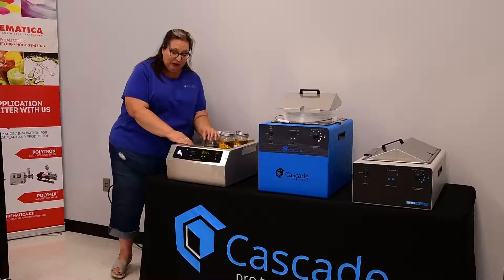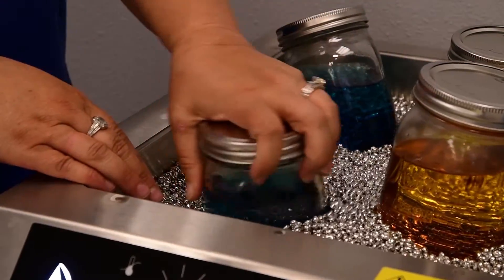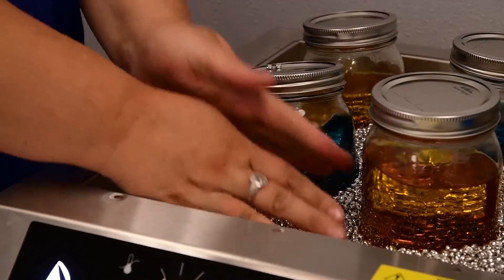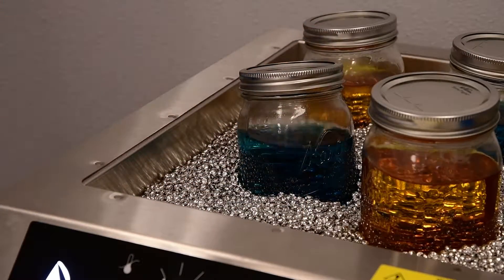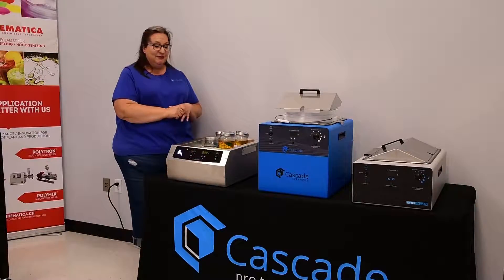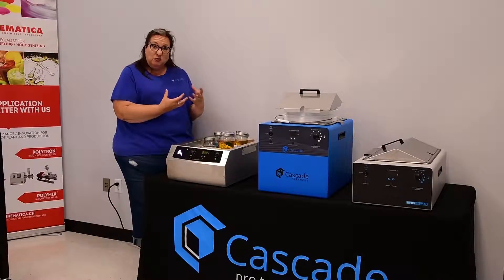We have worked with microbiologists to develop the lab armor bath beads. Instead of putting water in a water bath, we put in these highly polished aluminum beads, and we've done a ton of testing on this. We'll do over 30 temperature probes in the bath in all different locations, and what we found is that it has the same if not better thermal performance as water. In terms of heat-up time — same as water. Temperature uniformity — the same as water. And in the event of a power outage, this actually performs better than water because the aluminum beads develop more thermal mass and they stay warmer a little bit longer.